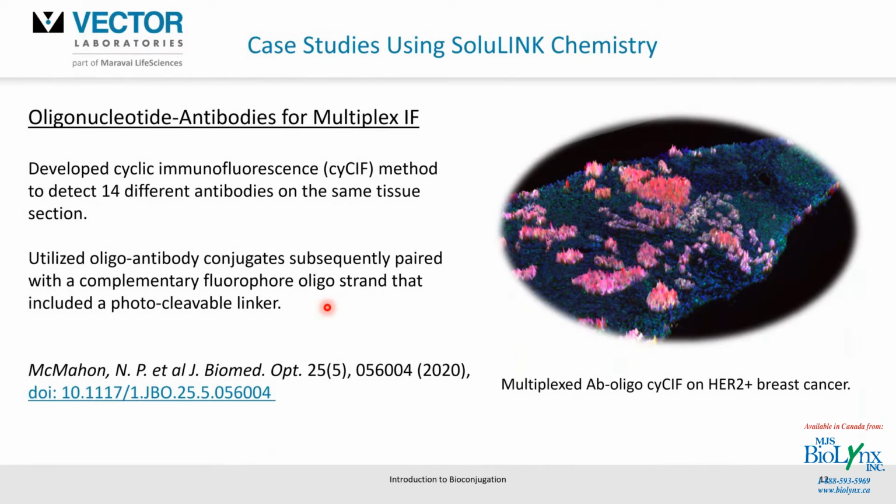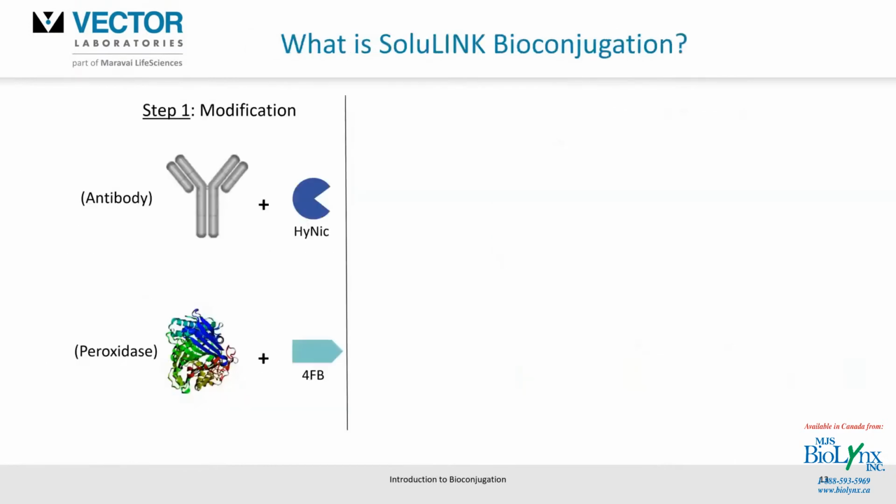So hopefully this gives you some idea about how bioconjugation is being used out there, and it's certainly coming to prominence in a lot of methodologies. Okay, so we've just had a look at some interesting case studies. Let's have a dive now into the Solulink chemistry.